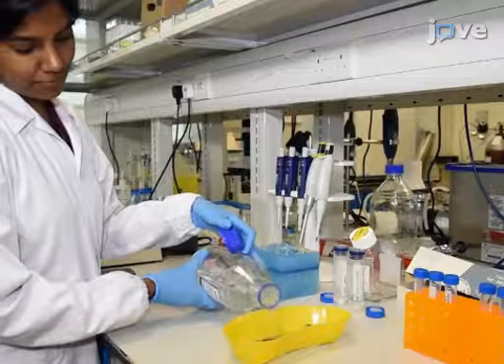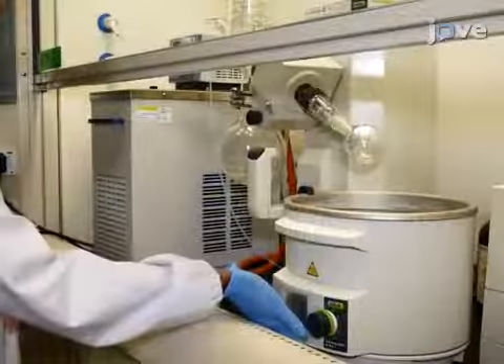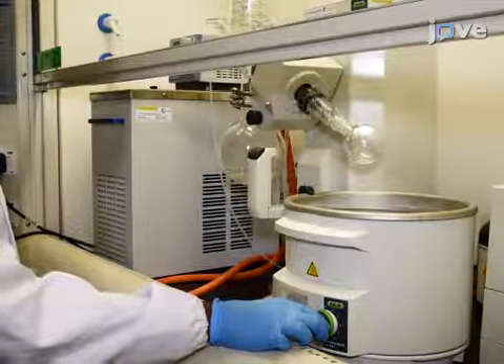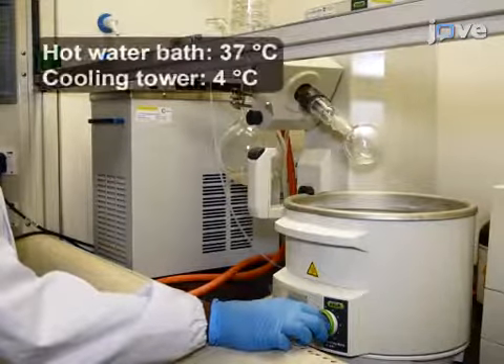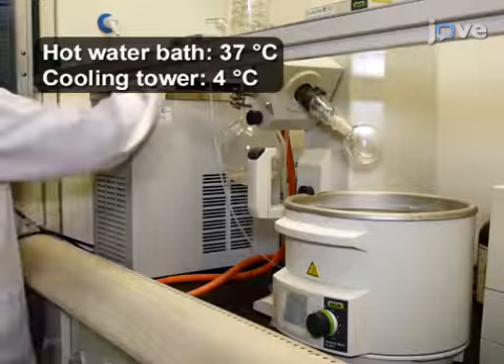Sterilize a handheld mini extruder set using 70% ethanol. Next, turn on the rotary evaporator and set the temperature of the hot water bath and the cooling tower to 37 and 4 degrees Celsius, respectively.